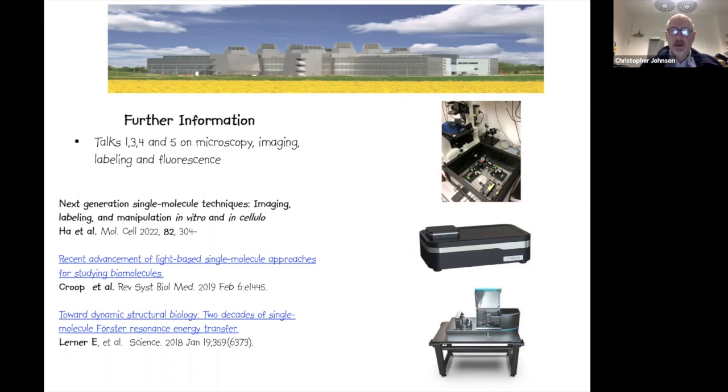Other disadvantages of iSCAT is it doesn't tolerate other potential noise in terms of reflection generating components in solution. So things like detergents and high concentrations of glycerol or other components tend to be problematic in that, although they're often not big enough to come into the molecular mass measurement range, they generate noise, and all of the noise piles up around 50 kilodaltons. So that can be quite problematic. In contrast, SEC-MALS is quite happy to work with those additional additives. And also you can even get additional information about how much detergent, for example, is complexed with your protein.